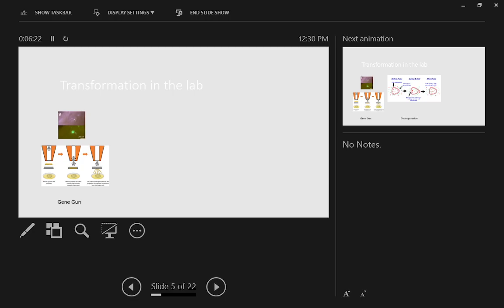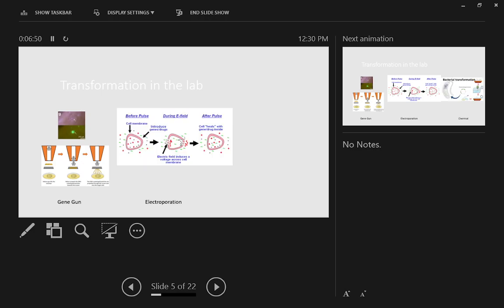And this is actually really handy for a variety of different cell types. We used to use this a lot more than we do currently because the current methods are a lot better and we have better methods overall to make these kind of modifications. But at the time, this was one of the only ways you could do this. It's also really helpful for cell types that are extremely resistant to modification, like plant cell types and things that have a lot of rigidity to them that make it difficult to alter the tissues. So it's actually really cool. Not done as much anymore, but still really neat.